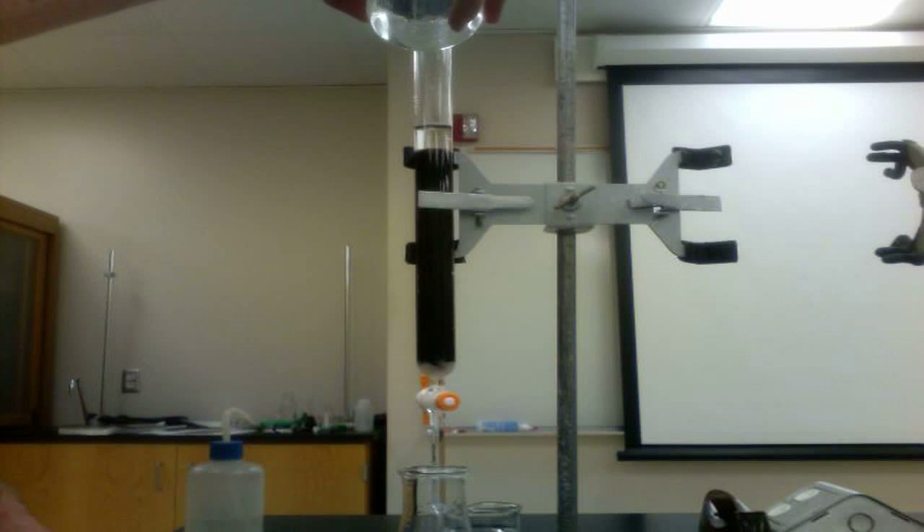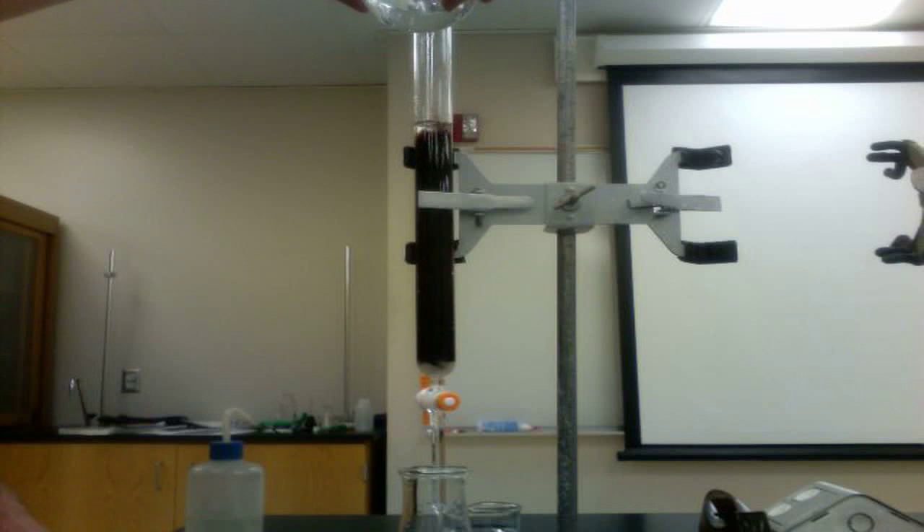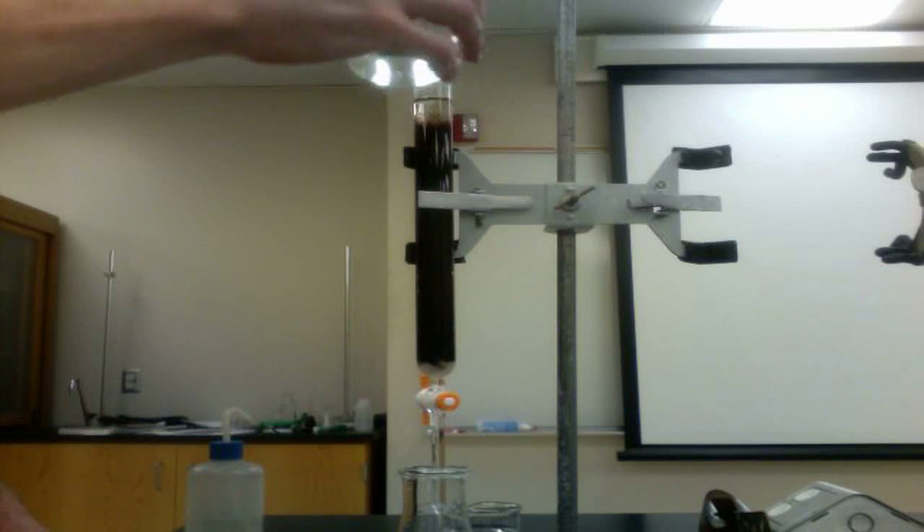Carefully add the acid to the column. Open the stopcock at the base of the column to allow the acid to flow through the resin. Never allow the solution to go below the level of the resin.